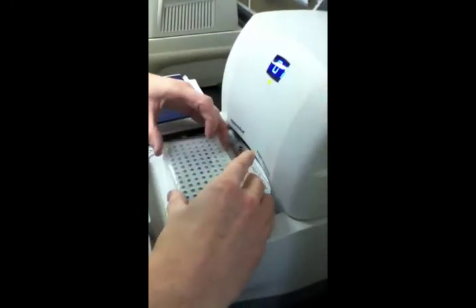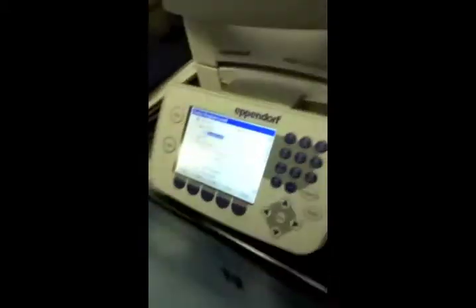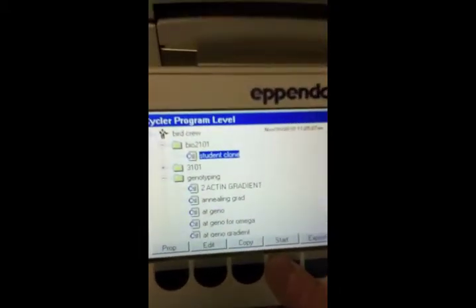Okay, we're ready to roll. Shove that baby into the thermocycler. Close the lid. It's got to be hot. Can you see the graph on here? Yes, we can. We'll get a glare. Can you see it? There we go. That'll work.